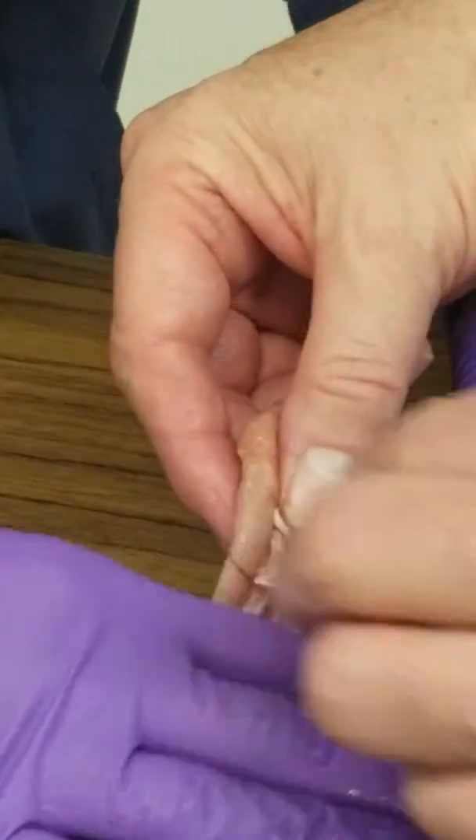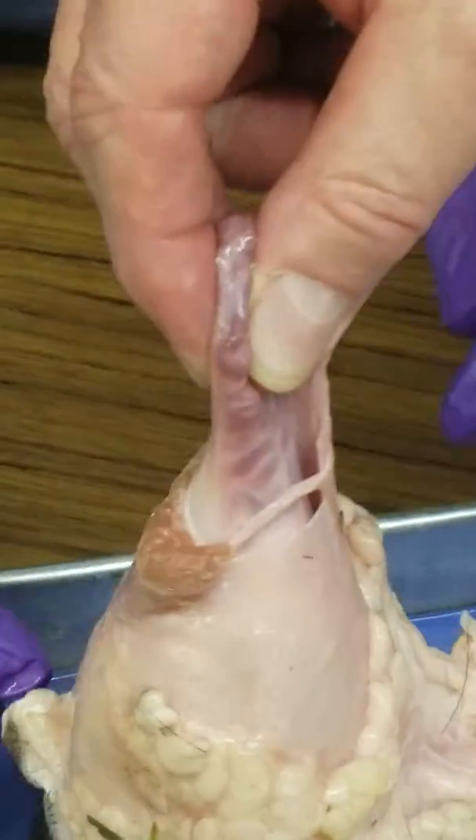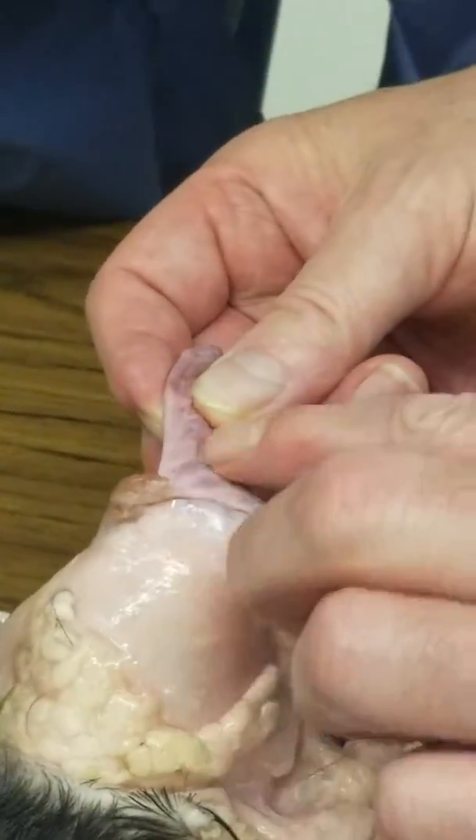We don't see the spermatic cord right now — but over here there's one right there. You can actually see a lot more of the vasculature, the vessels. So there it is — the spermatic cord.